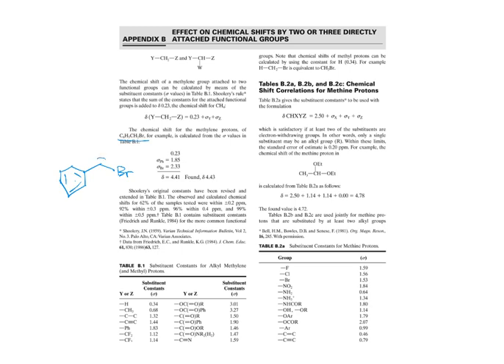So we'd be calculating the chemical shift for the 2 protons on this carbon right here. So we start with 0.23. We have a bromine on one side. We look down on the list, and I can't even see, it's blocked by that thing. Oops. It's in 2A. 2A, is that the same? 1.53, but I think, oh, but they have 2.33. I think, yeah, maybe it's down there.